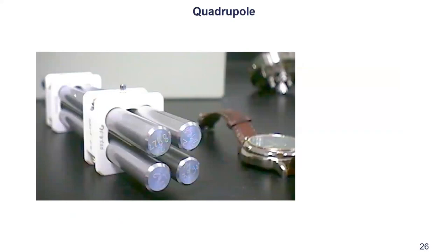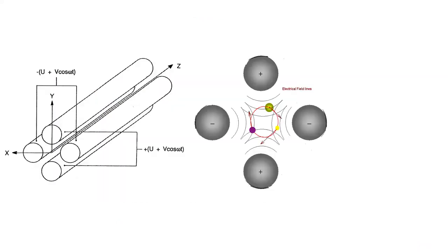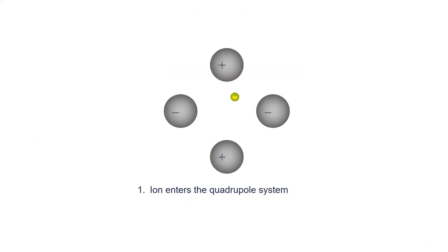Coming to more characteristics now, I want to speak about some mass analyzers. We have the quadrupole, which is very nice, I think. What you need to be aware of is that in the name quadrupole, you already have that there are 4 electrodes, and always the opposite sides have the same charge. Based on this, we can actually move the ions through this system, which is also very important.